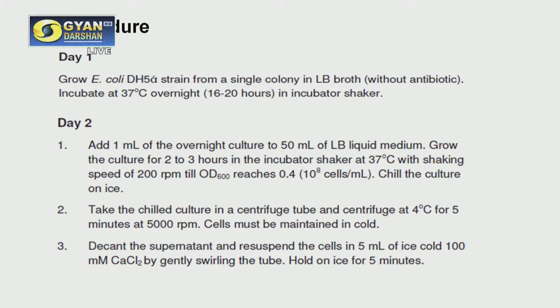because you cannot undergo the reaction at room temperature or even at higher temperature, because in that case there will be a heat shock, and the bacterial cells will not be able to take up the DNA, because you need the cold treatment. Specifically, you need the calcium chloride cold treatment for creating the minute pores. And you cannot subject the bacterial cell to prior osmotic shock by exposing it to room temperature or high temperature.